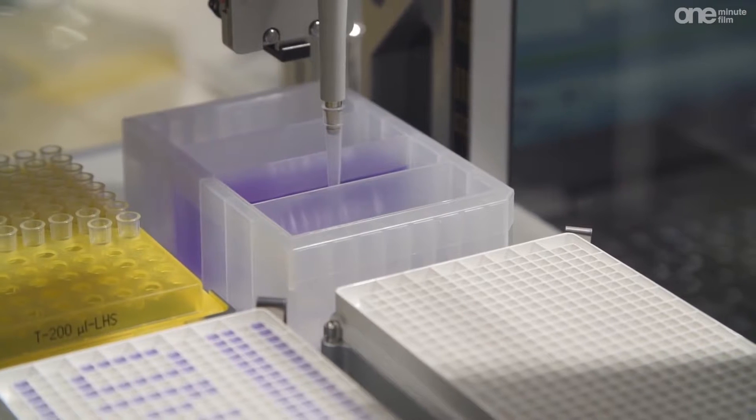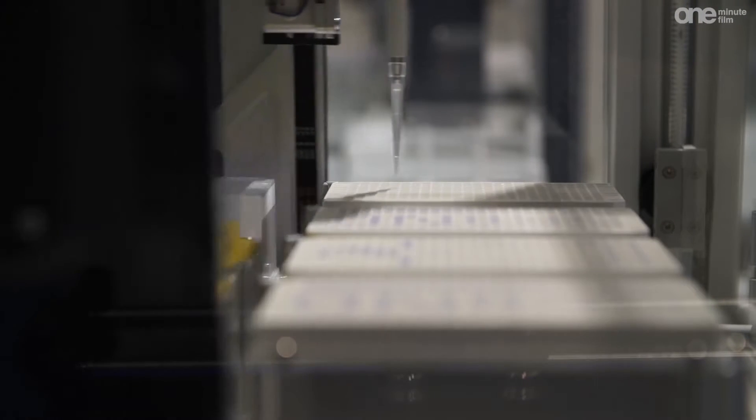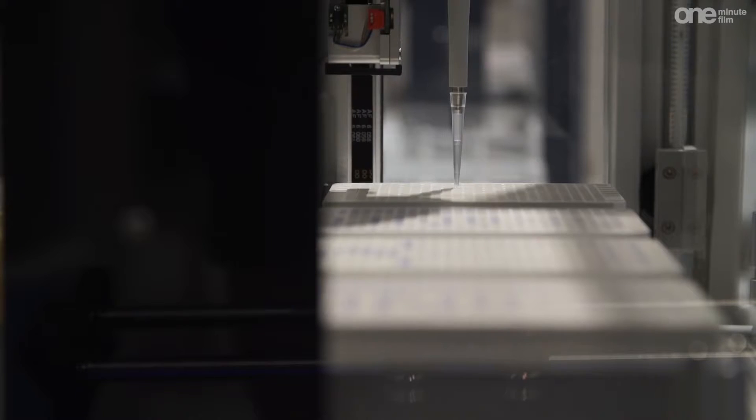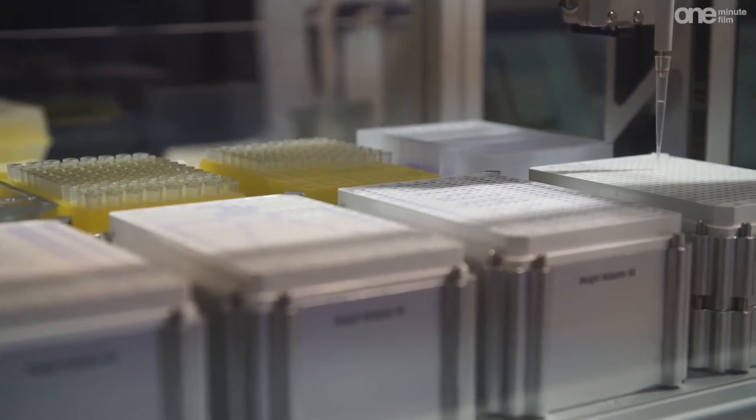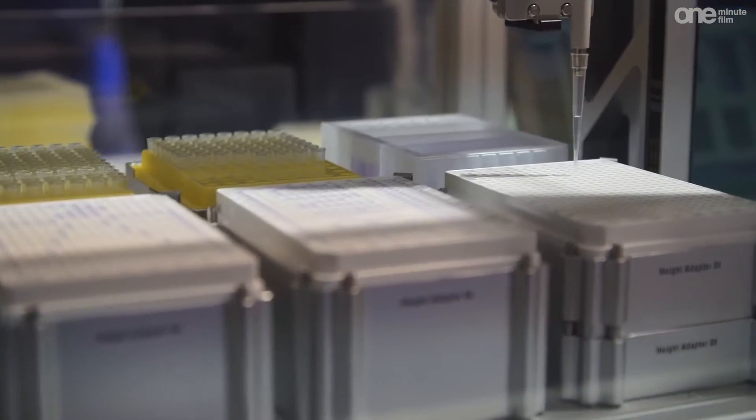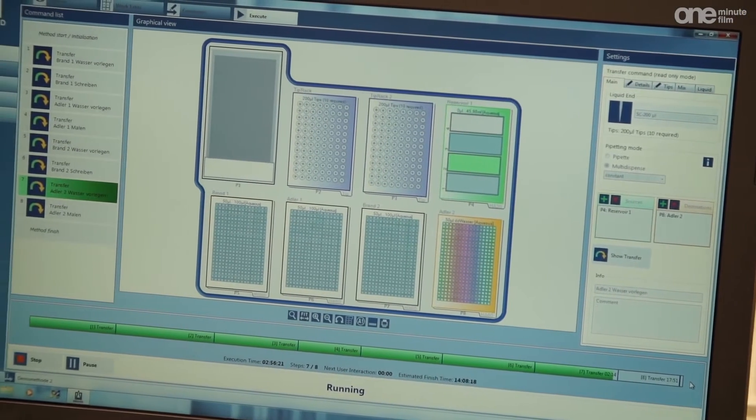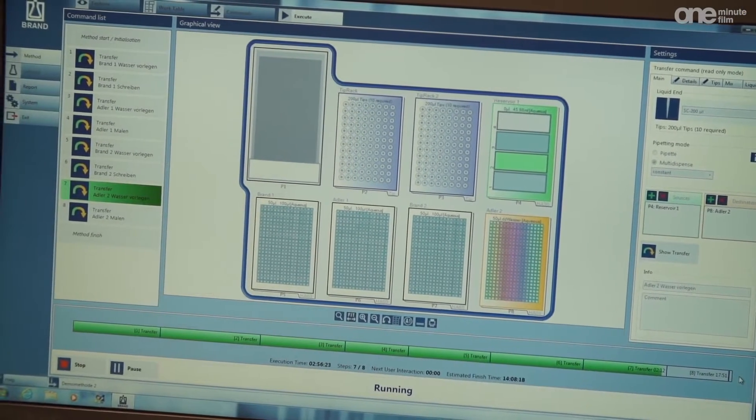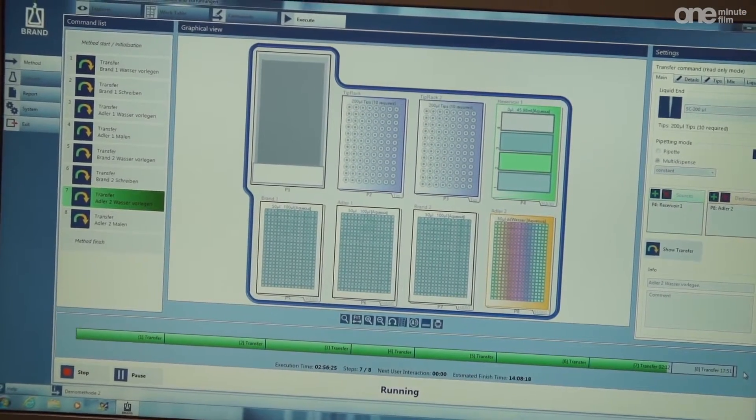The instrument is very compact with a small footprint. It has eight positions in a 60 by 50 centimeter workspace with very intuitive and flexible software. The liquid handling station also delivers the high precision that is extremely important in dispensing liquids in the previously mentioned disciplines.